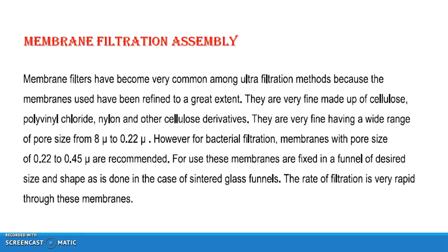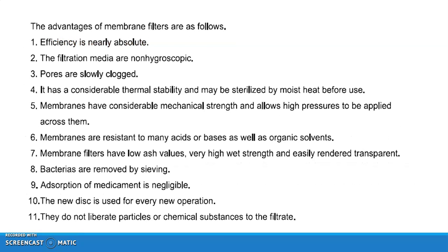For use, these membranes are fixed in the funnel of a desired size and shape, as is done in the case of a sintered glass funnel. The rate of filtration is very rapid through these membranes. The advantages are efficiency is nearly absolute, filtration media are non-hygroscopic, and pores are slowly clogged. It has considerable thermal stability and may be sterilized by moist heat before use. Membranes have considerable mechanical strength and allow high pressure to be applied across them. Membranes are resistant to many acids as well as organic solvents.